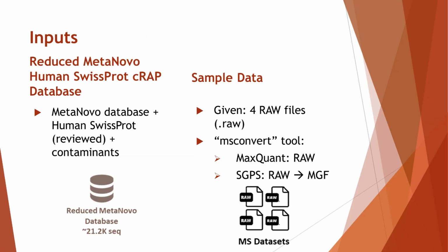We will now cover the inputs and main workflow steps. We will end on the final expected output for this module, which will set us up for Module 3 verification. For tool specifics, please refer to the GTN tutorial page.